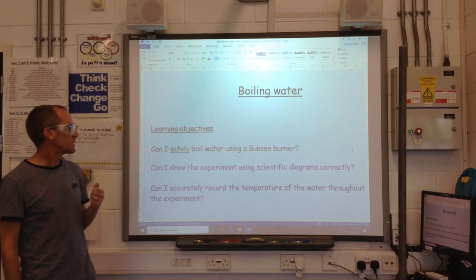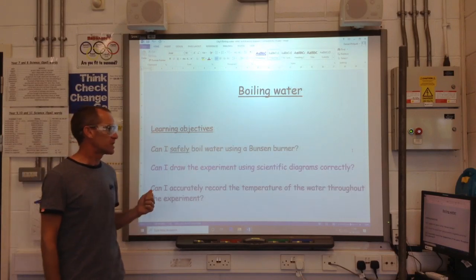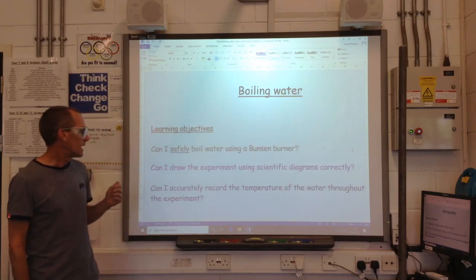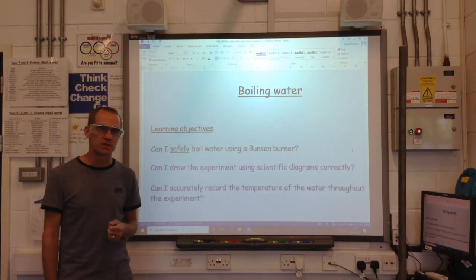Three objectives. Can I safely boil water using a Bunsen burner? Can I draw the experiment using the scientific diagrams correctly? And can I also accurately record the temperature of the water throughout the experiment?